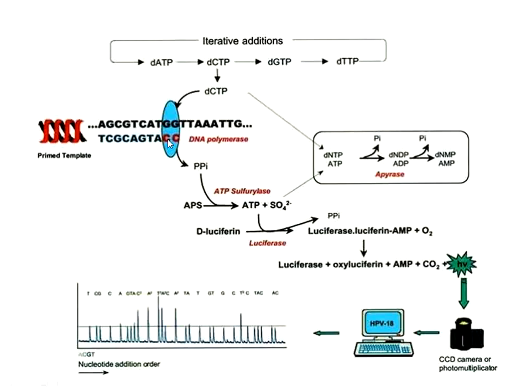If a single nucleotide is added, the light generated is low, okay. If two consecutive same nucleotides are added, the amount of light generated is more. So based on the light intensity, the number of nucleotides added during the DNA sequencing can be determined. If any nucleotide does not get added due to non-complementarity, then such a nucleotide, for example here, the first nucleotide that we have added in the sequential addition is adenosine triphosphate, but it does not find the complementary base here, so it will be degraded by apyrase enzyme action into adenosine monophosphate.